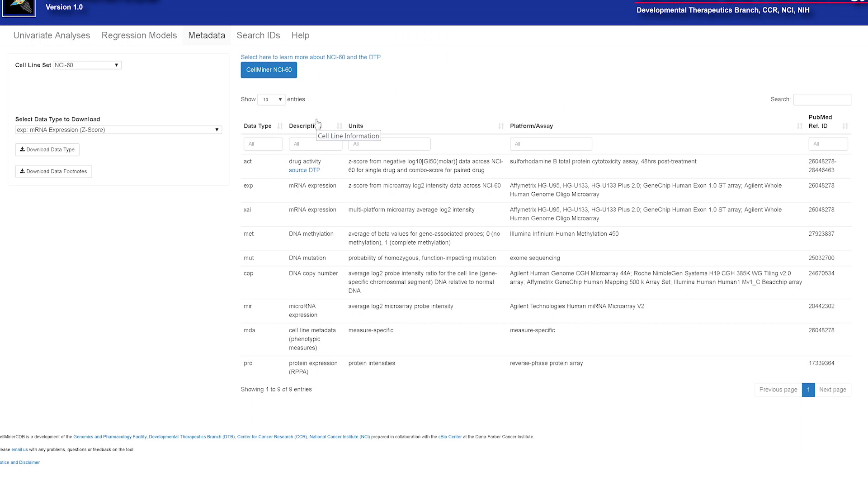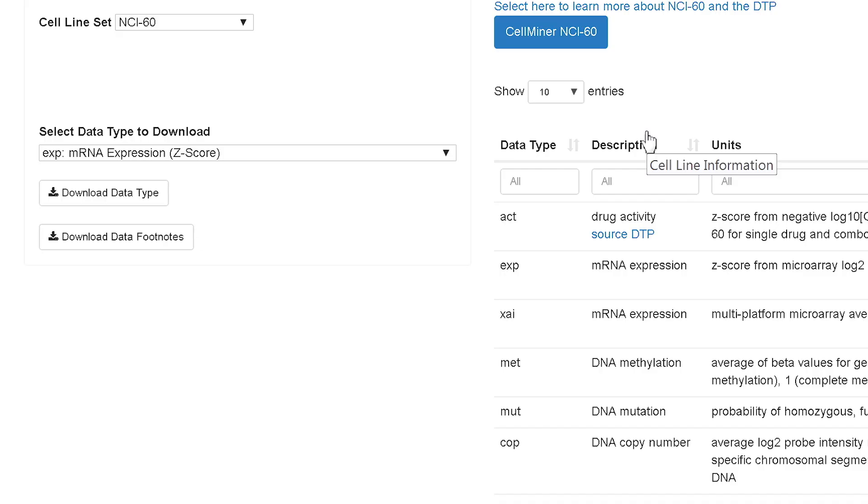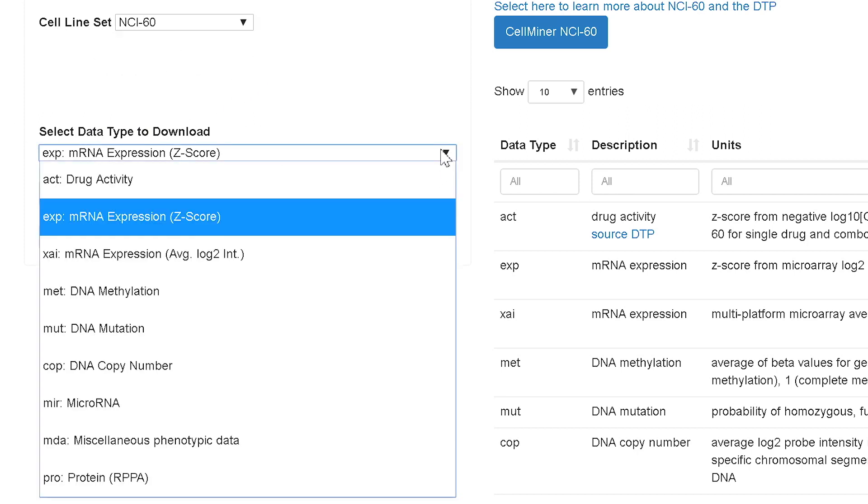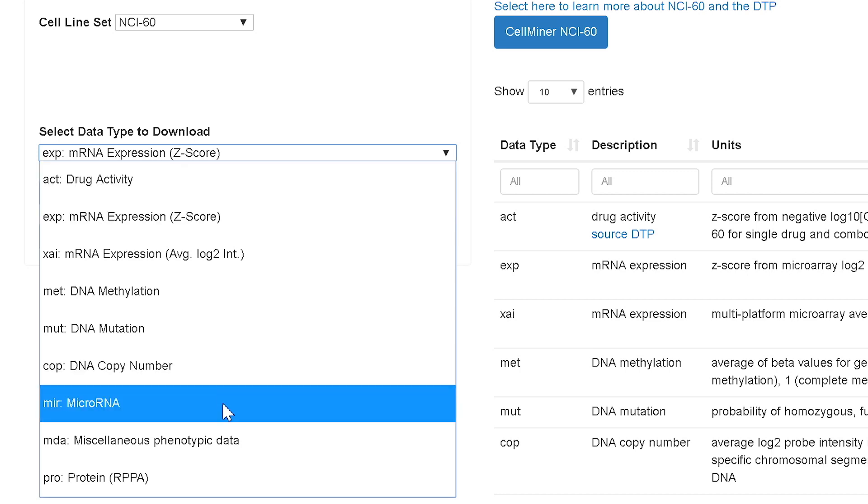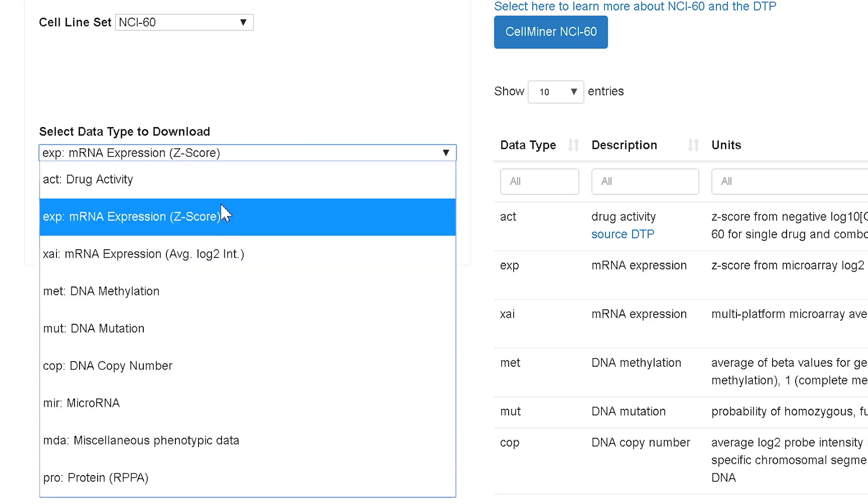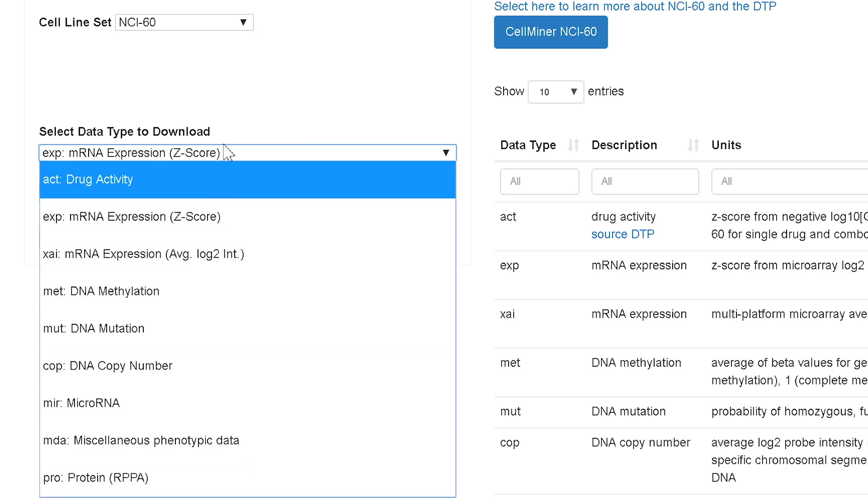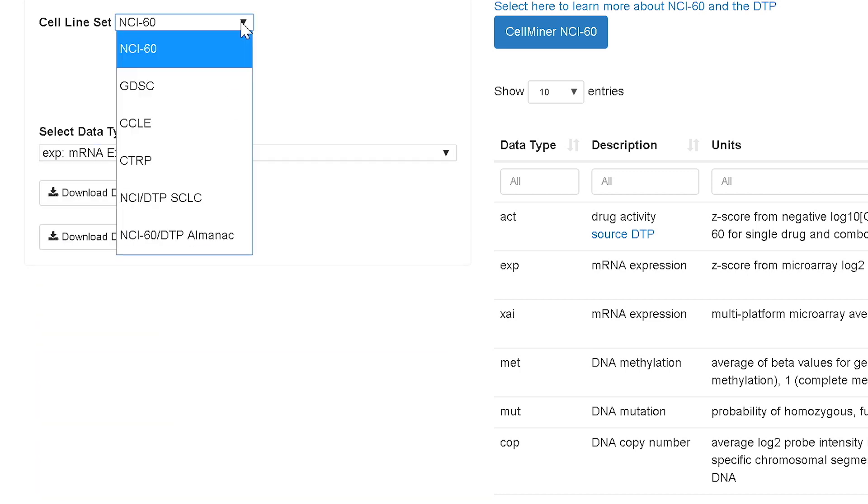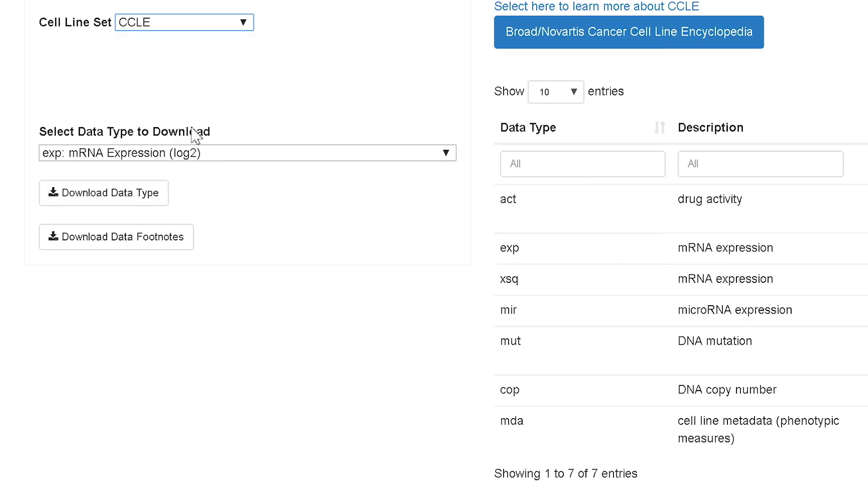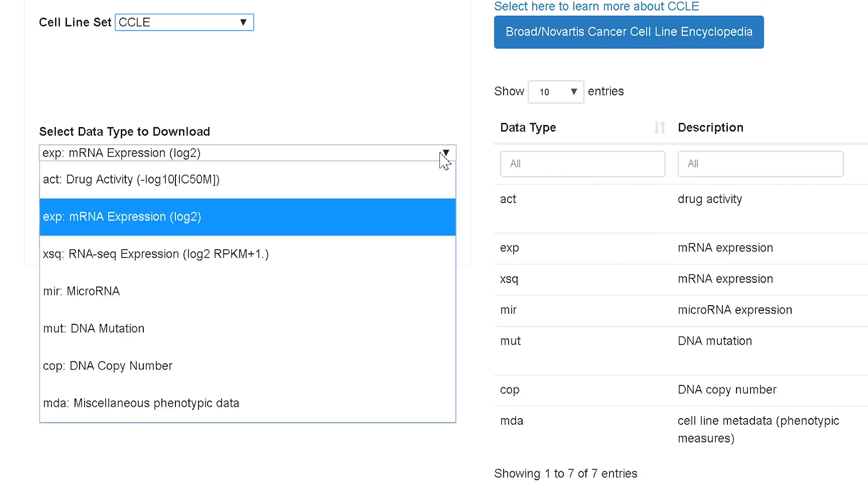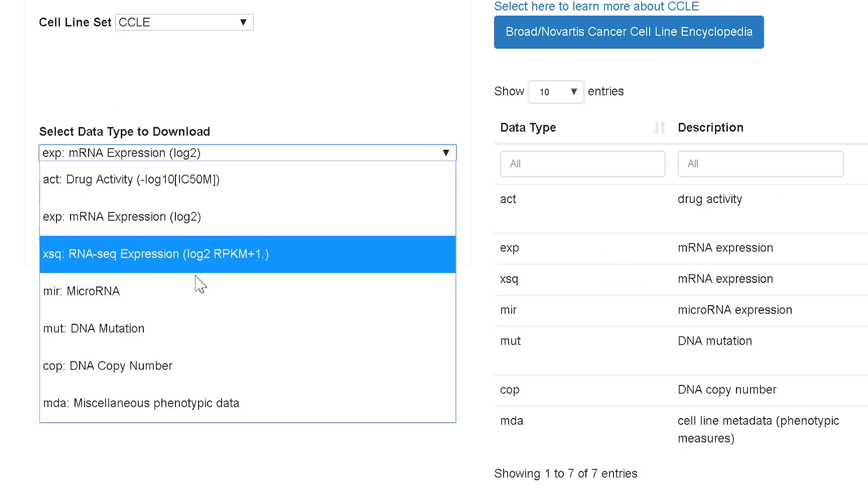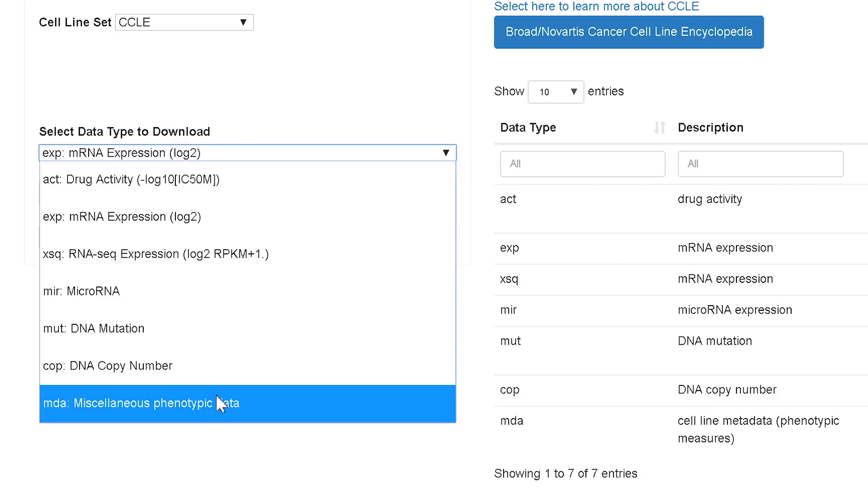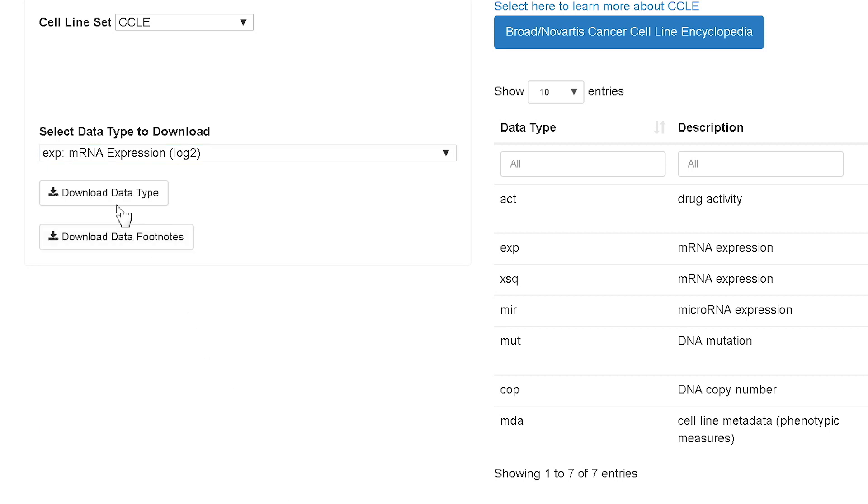Metadata allows one to see the databases available for each cell line set and to download any of them. So in this case, you see I have the NCI-60 up here first. By hitting this arrow here, you can see all these different databases are available. If I switch to a different set, say CCLE, you see a different set of databases are available. Each one may be downloaded here at the download data type.